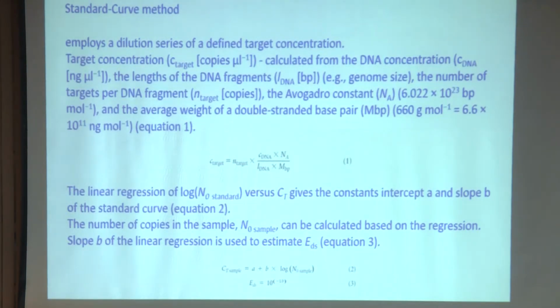And again, how do we prepare a standard curve? All of us must know now, as we have gone through several practicals, what the template is and what the length of the PCR amplicon is. If you know the sequence of your amplicon, you are in a very safe place, because you will even be able to know the molecular mass of the amplicon.